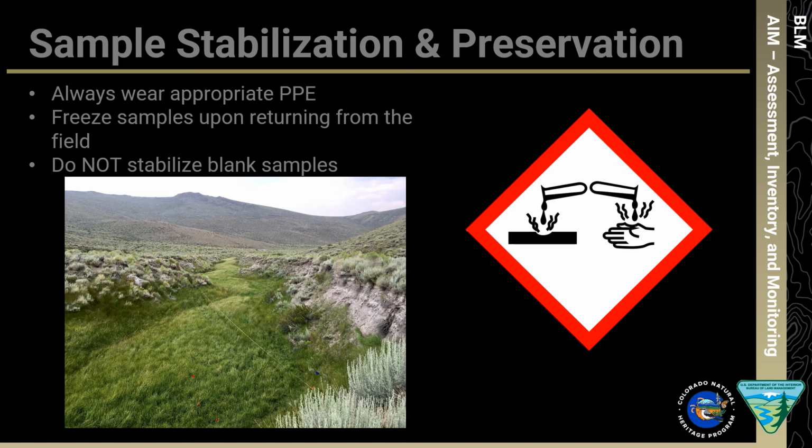Always be sure to exercise extreme caution whenever using sulfuric acid. Nitrile gloves and eye protection must be worn at all times when working with sulfuric acid. If any sulfuric acid comes in contact with the skin, be sure to rinse with a mild soapy solution or rinse continuously with water if soap is not available. Be sure to neutralize any spills on the ground or other surfaces with generous amounts of baking soda.